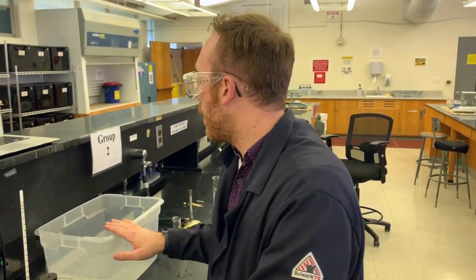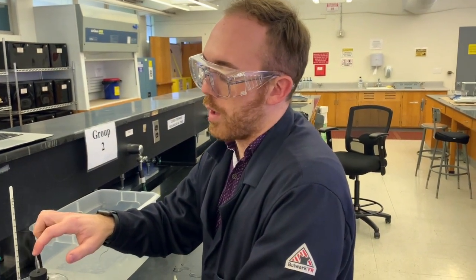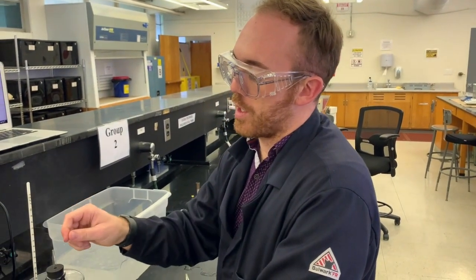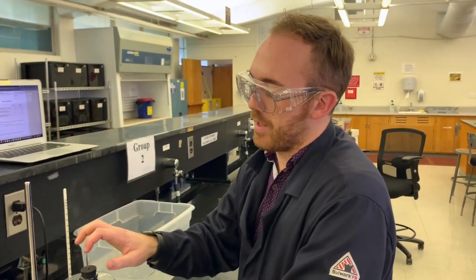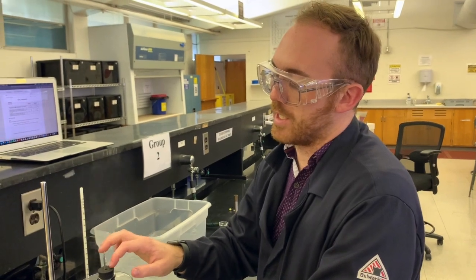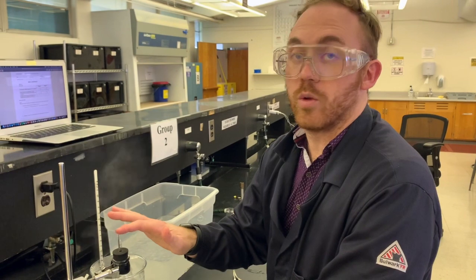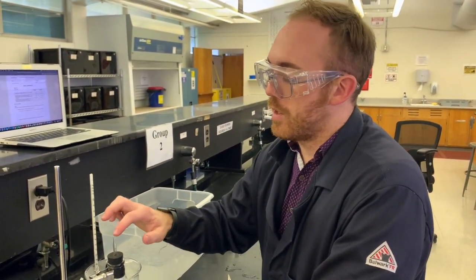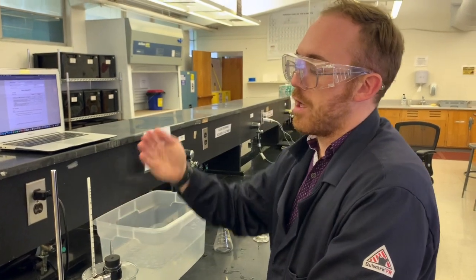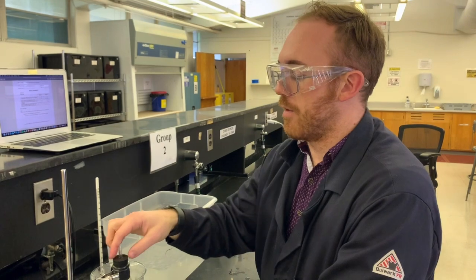An important thing to note when you put the flask underwater is that once you actually let the flask pull water in, it's very important that you don't allow bubbles to leave the tip of this. If you do see bubbles, it's a good sign that you're letting water in because it's not tilted quite right. You want to be only drawing water in caused by temperature change. So it's very important that you keep the tip of this downward and prevent any kind of bubbles from leaving the flask.